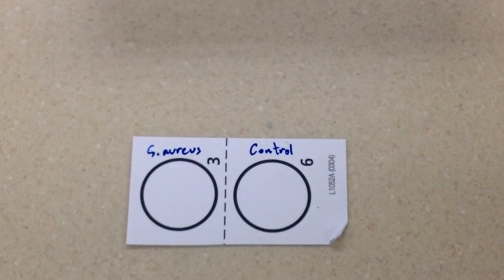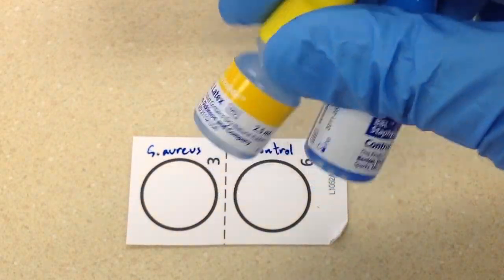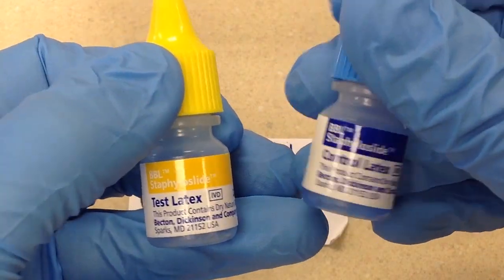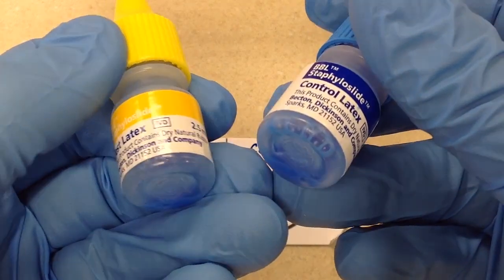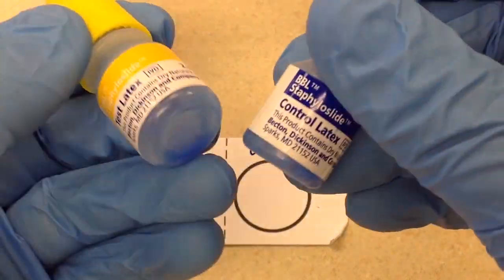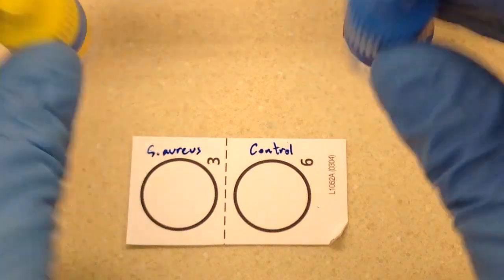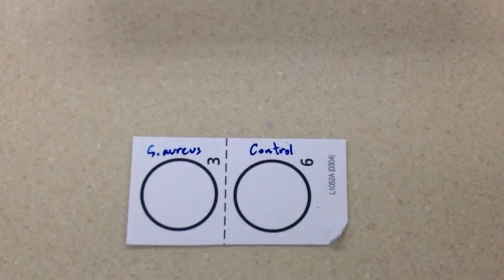First we need to apply our reagents to the card. As with any reagent, they need to be at room temperature and well mixed. Latex reagents have latex beads in them which tend to settle and can get a little stuck together, so we need to make sure they are well mixed. I've already mixed them, so they're ready to go.